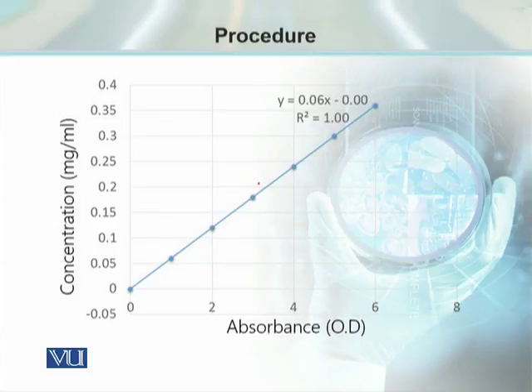Those points were used here to plot a standard curve, and then these points were used to draw a regression line. Regression line can easily be drawn using the Excel software. If the concentration is best, if the optical density is okay, there is no error because of the spectrophotometer or because of any contamination, any unwanted material in the tubes, then you get the best fitted line.